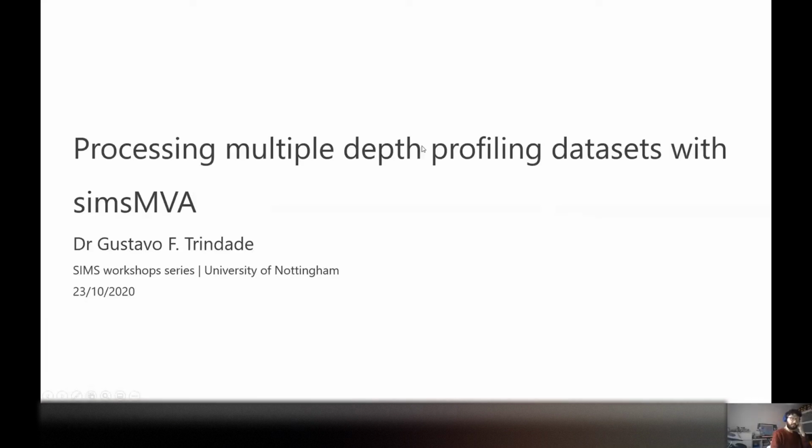Okay, so this was a suggestion from Steffi, actually. She told me lots of people are doing mostly depth profiling, especially now with the ROIs. I covered this before in the general overview of simsMVA and MVA, but she thought it would be nice to have some sessions focused on depth profiling. So I will start with this one.